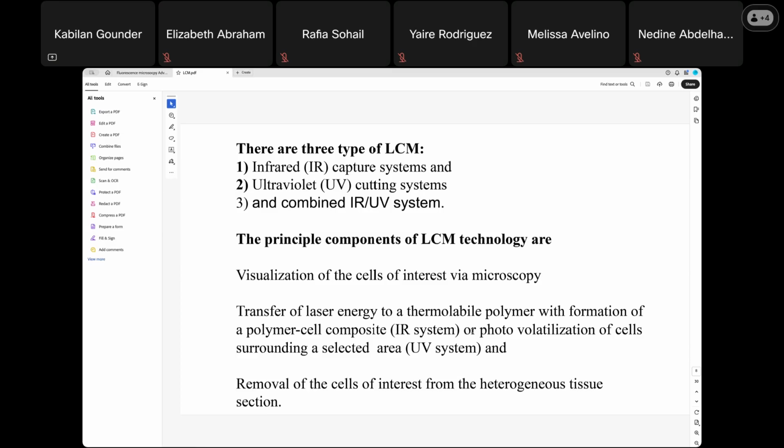So you can choose, based on the structure, the particular cells you want to isolate, or if you use a fluorescence microscope, wherever your target is expressed, you can collect that. Our goal is that whatever you see under either the fluorescence or light microscope, you can isolate the cells of interest using this technique.